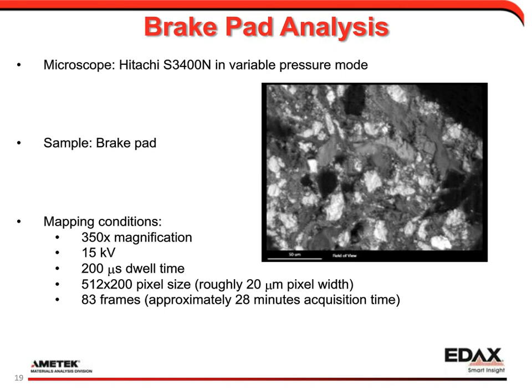So to get the perfect analysis, really push the limits, one thing is you need to satisfy those conditions. The other thing is you need good statistics. You have to have a lot of counts in your spectrum to get a good quant number and a good reliability of those. It comes down to the statistics, basically.